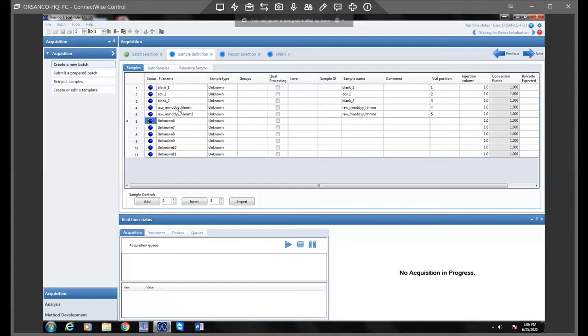And then however many you need to do for the day, we generally ask sites to do about 3 to 4 raw samples a day. That way we can get a pretty good estimation of what's going on during multiple hours of the day versus just 1 or 2. It's just better data collection.